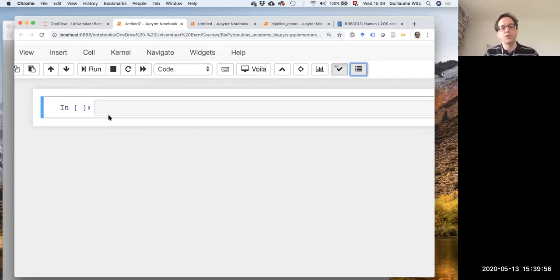So the first thing I just really briefly wanted to mention, because questions came up on this topic, and in my interactions with people, I also see these questions coming up very often. It's about how you use NumPy and what the dimensions of a NumPy array are. So for this, I will use this library to import that I mentioned last time. And I will say from AE.